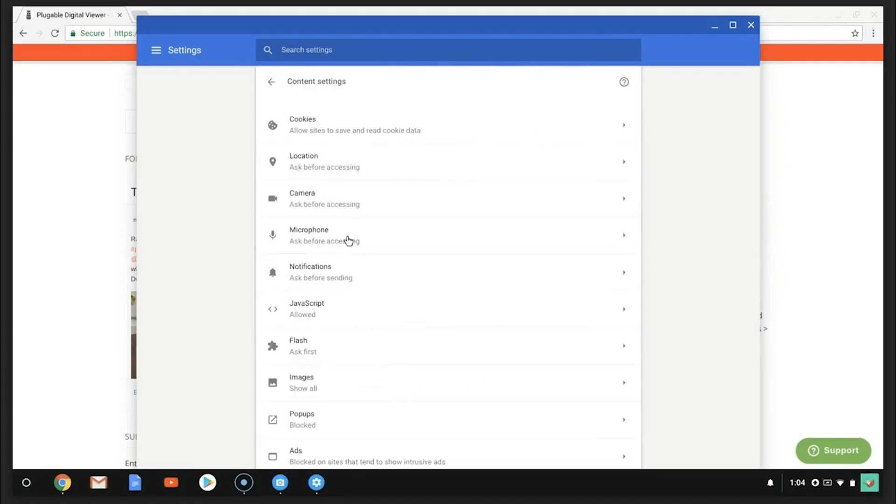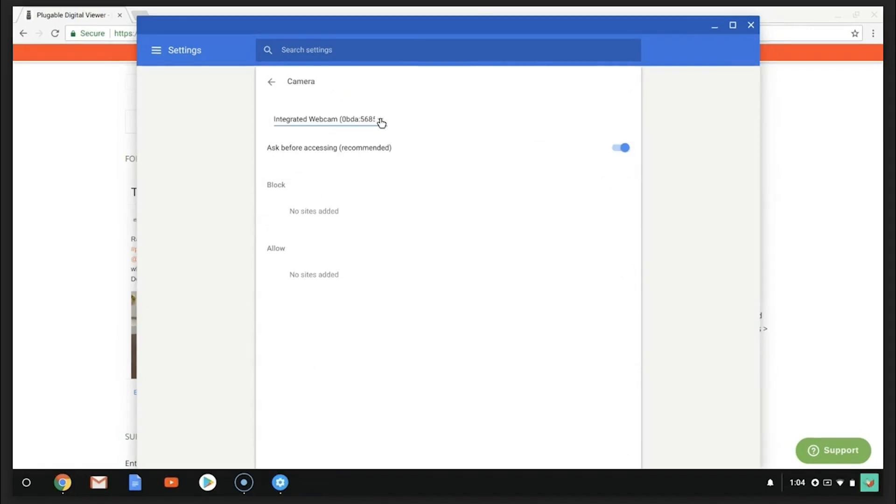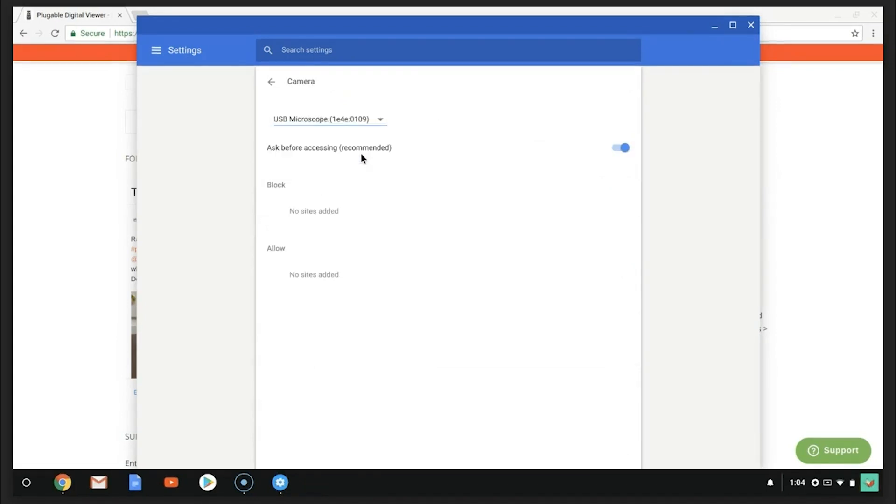Then, click on Camera. The drop-down menu will display integrated webcam. Click on the small arrow and choose USB Microscope.